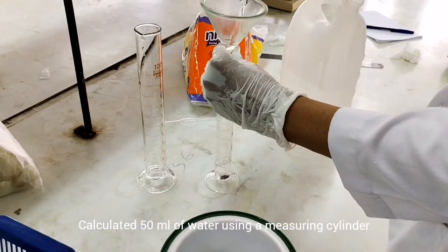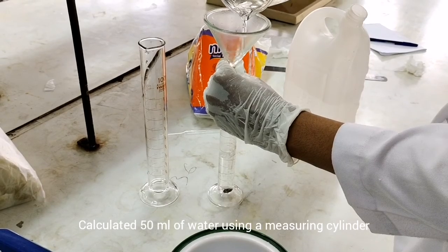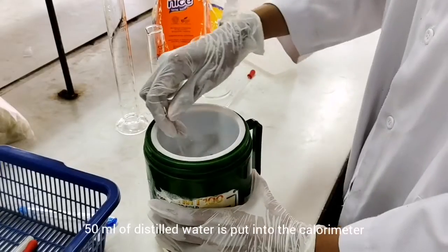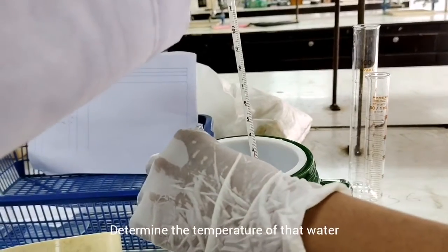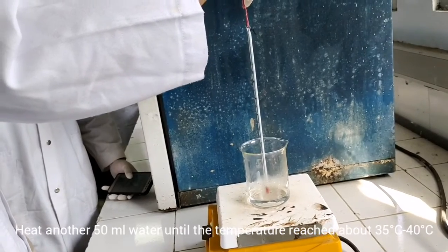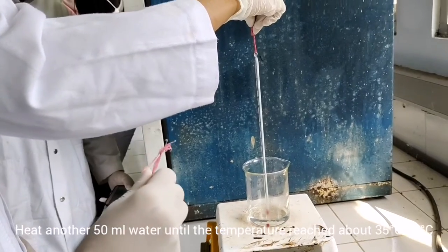Okay, we are going to the first test: the calorimeter constant. First, measure 50 milliliters of water using a measuring cylinder. Then, 50 milliliters of distilled water is put into the calorimeter. The third is to determine the temperature of that water. Heat another 50 milliliters of water until the temperature reaches about 35 to 40 degrees Celsius.